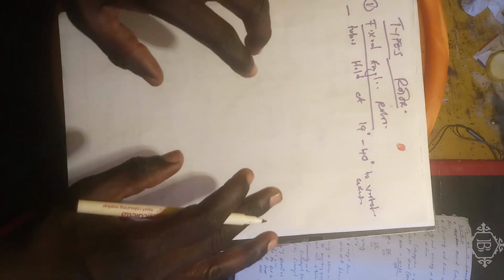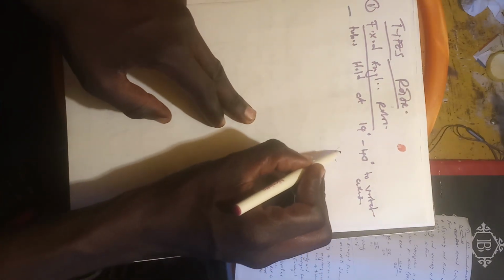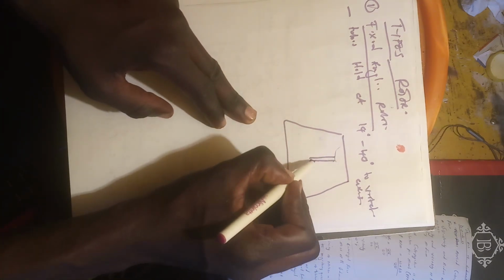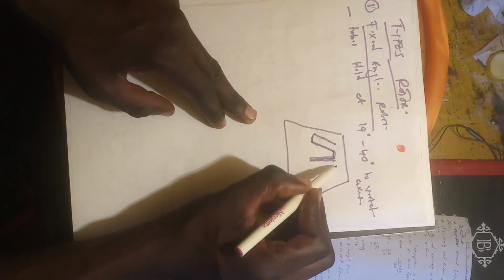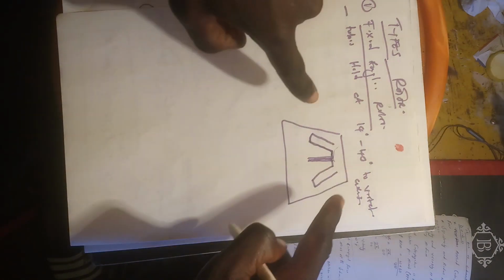So how it actually looks is this. You have the vertical axis there, and these rotors hold tubes like that at an angle. They're not straight, but they're like that.